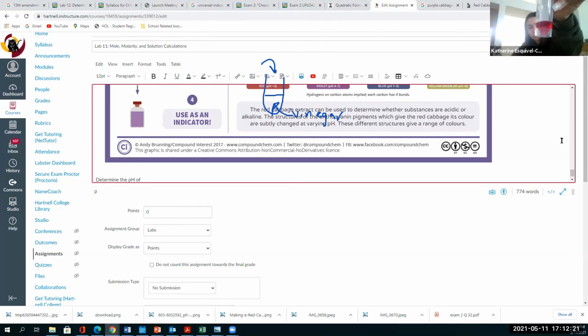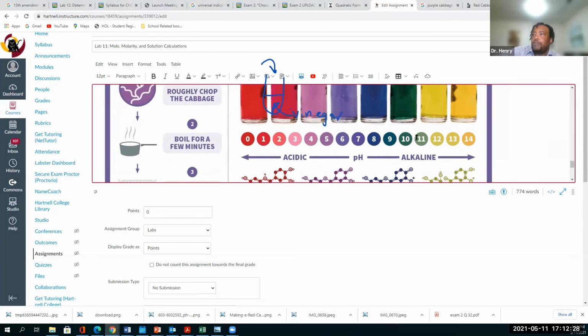Okay, so then record the color. And then determine the pH. Here, this is out. Thank you. So I would say like a 1.